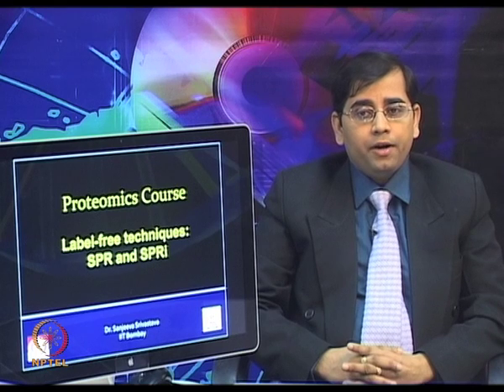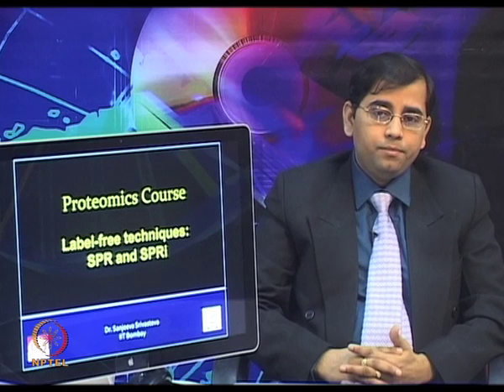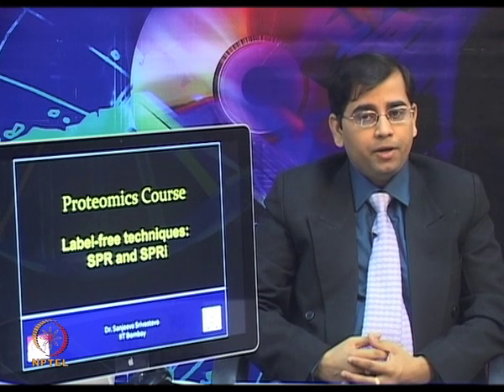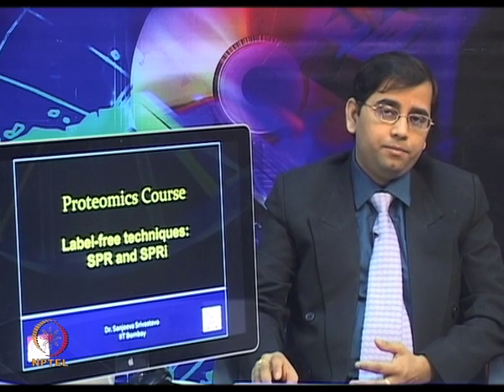Commonly, SPR measurements are collected in one of three modes: the scanning angle SPR, SPR wavelength shift and SPR imaging.